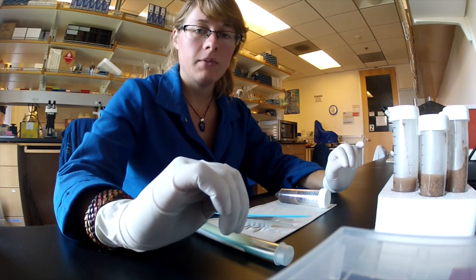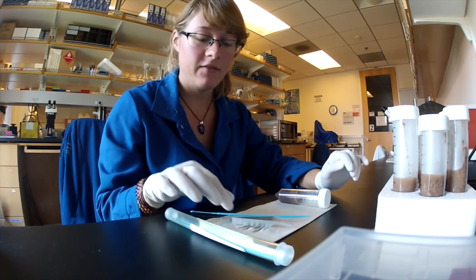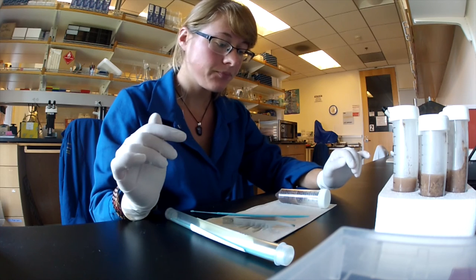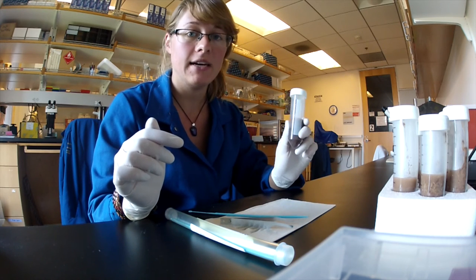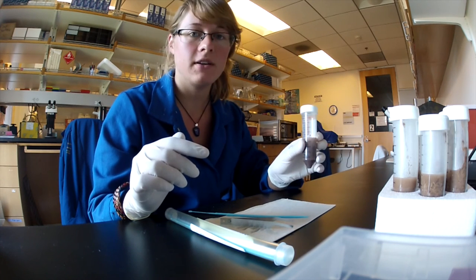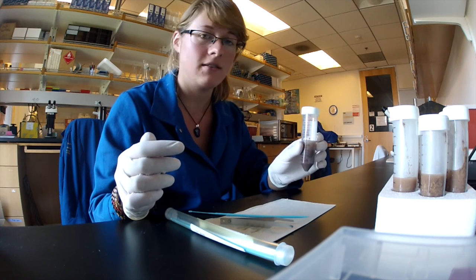There are a few other things to keep in mind when rearing the Polyphagous shot hole borer. When handling live beetles, use soft forceps with broad tips so that you don't crush them. You'll also want to surface sterilize your beetles before introducing them to the diet tube, since the diet is made specifically to harbor the beetles' fungus, and other fungi will get inside your tubes and contaminate them.